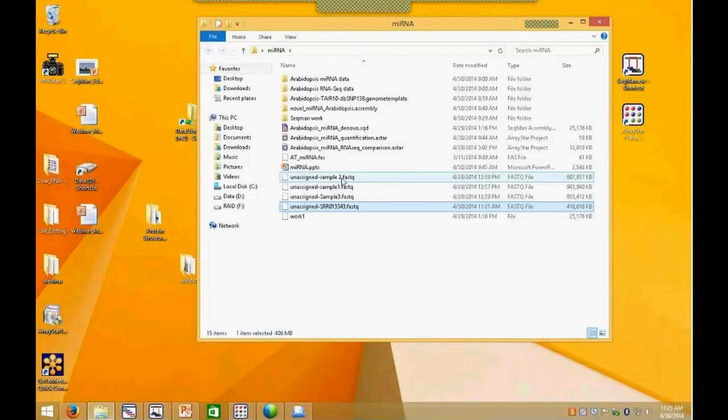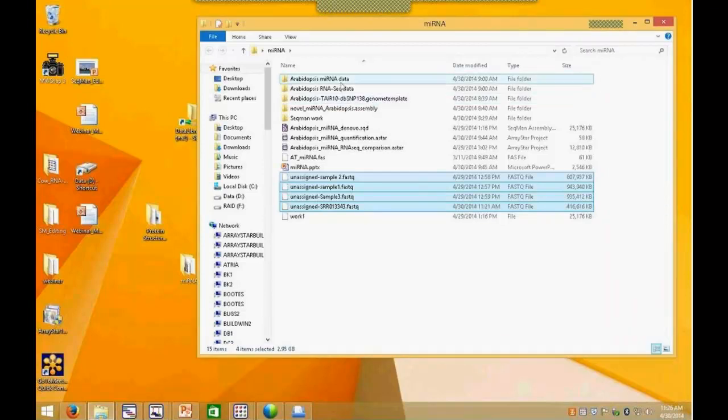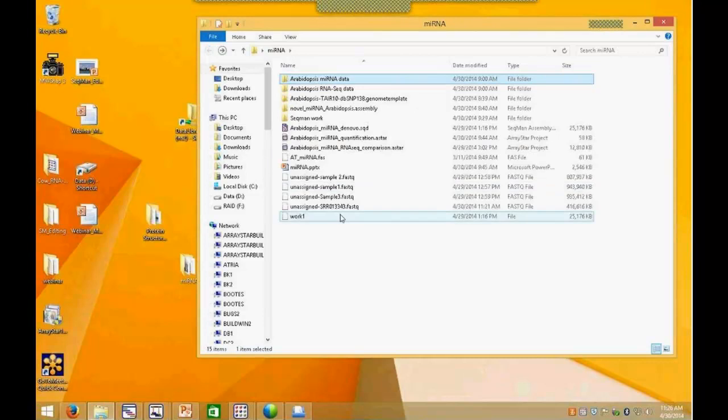And so I have 4 FASTQ files that were saved out, and you can see they're pretty big. They're almost a gig in size. So they're sizable data. And if I go back to the original data files, they're about 1.5. So we've got the bulk of the data not aligning to our reference set.